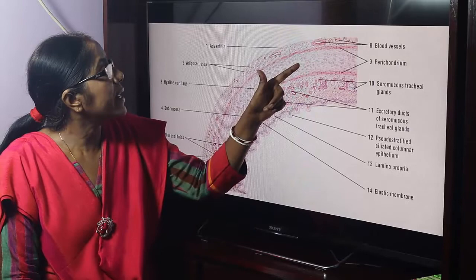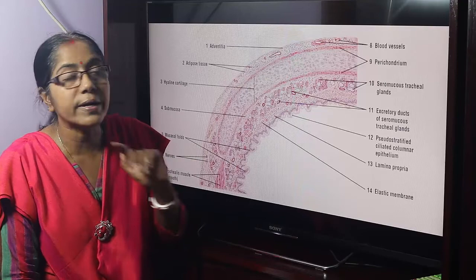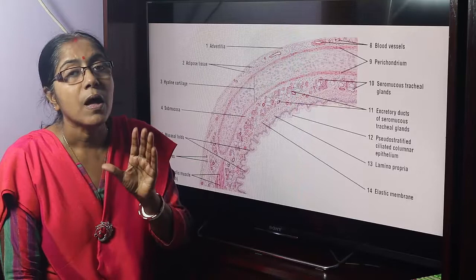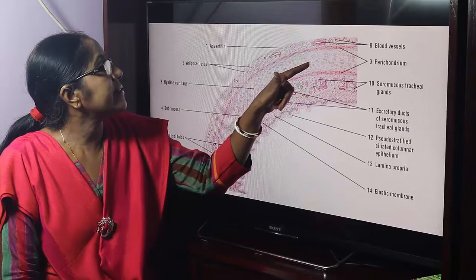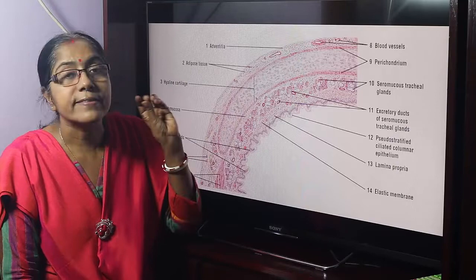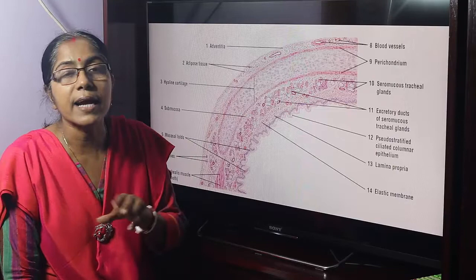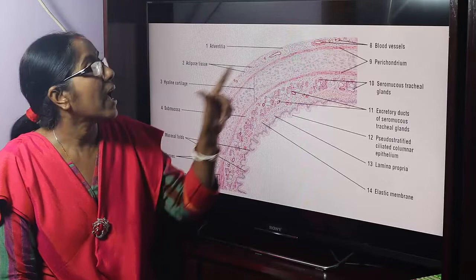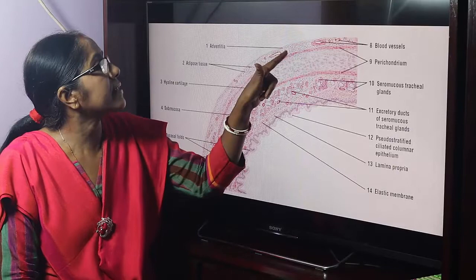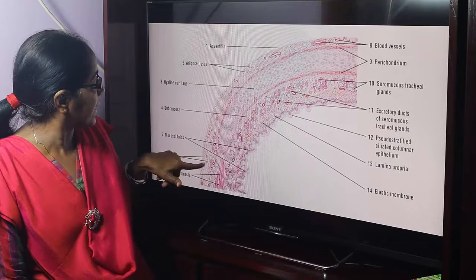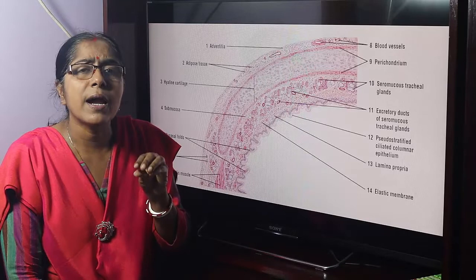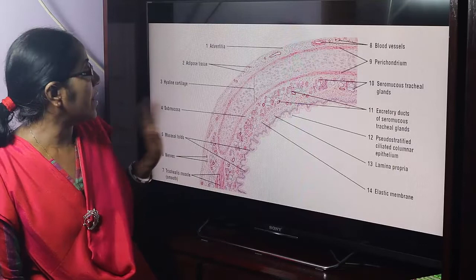This is the hyaline cartilage — C-shaped hyaline cartilage. These are the cartilage cells situated in cell nests (lacunae). The cartilage is covered by perichondrium, which is dense connective tissue. The adventitia is vascular — it has both blood supply and nerve supply. These are the nerves. This is all about the microscopic structure of trachea.